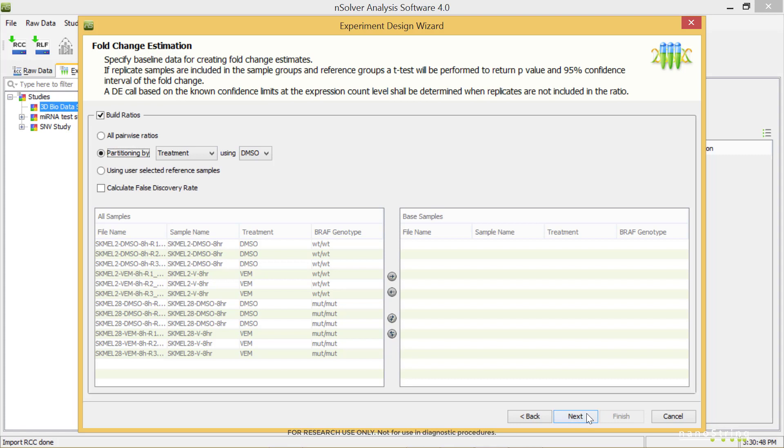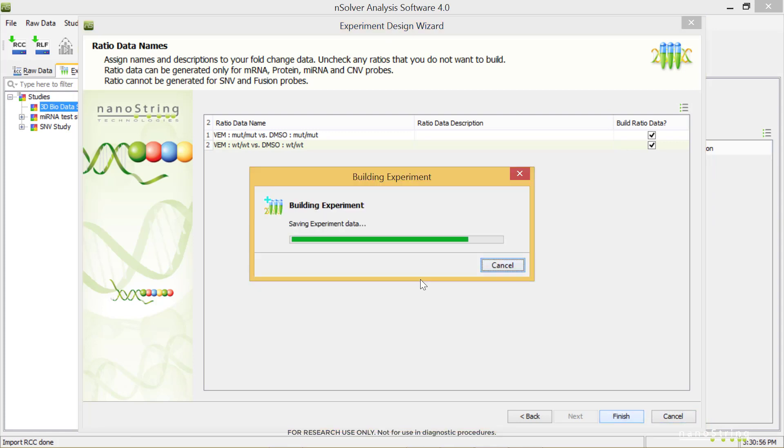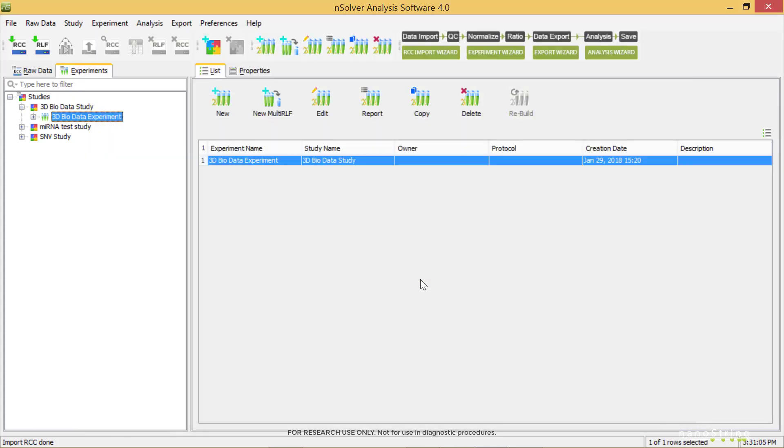Use the checkboxes here to confirm the ratios to calculate, and select Finish. Our experiment will now be built and will be stored under the corresponding study on the Experiments tab. Expanding the navigation tree next to it allows us to view all levels of data in the experiment.